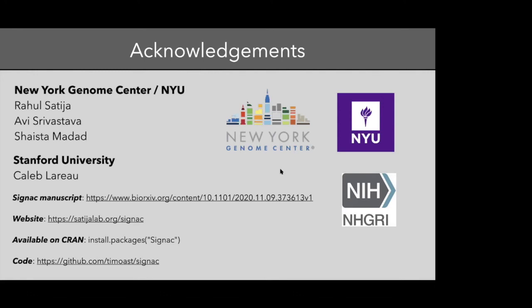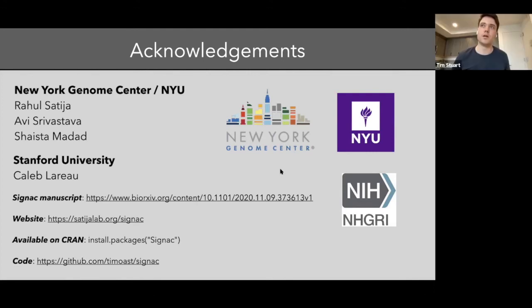And also, for integrating single cell ATAC, would you recommend using SCTransform normalization before integration? Right. So yeah, you can certainly use Harmony, and it's a great method. I think one of the things that we can do using the LSI anchoring that you can't do with Harmony is the reference mapping and data transfer stuff that I talked about.